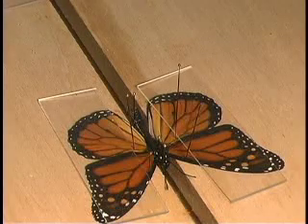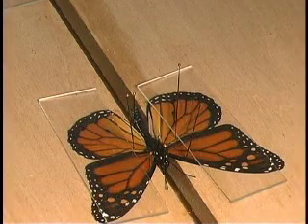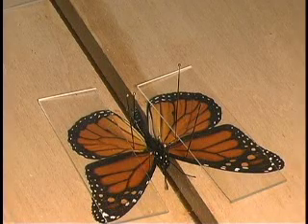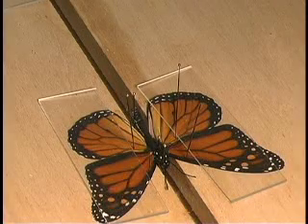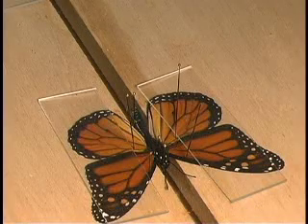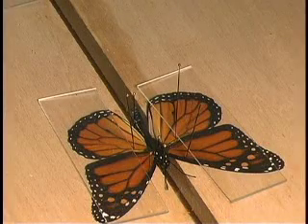Finally, there's two different schools of thought concerning whether or not you should remove the pins after the pins are inserted into the wing and positioned. If you do pin through the vein, there's a possibility that the hemolymph will dry on the pin, making it difficult to remove from the pin. So remember that if you're actually pinning through the costal vein. If you're not, if you're pinning behind it, then that won't be an issue, as in this case, and you can leave those pins inserted until the specimen is completely dry.